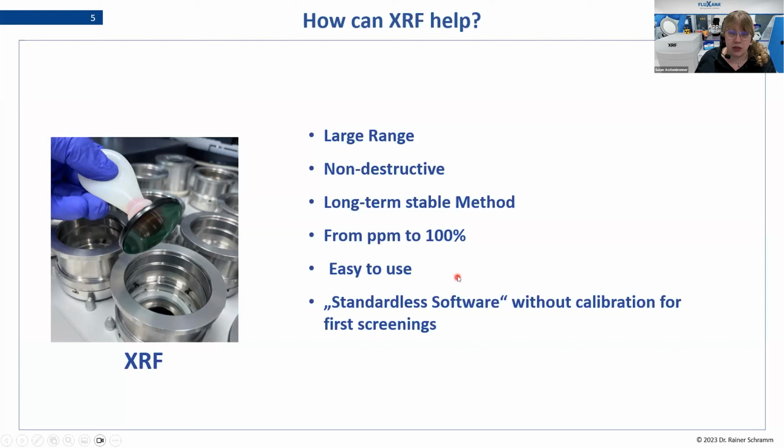The spectrometers, when they are calibrated, are easy to use. As soon as the calibration is up and running, the sample just has to be loaded, the button has to be pressed, and then the measurement can start. So this is also a big advantage.